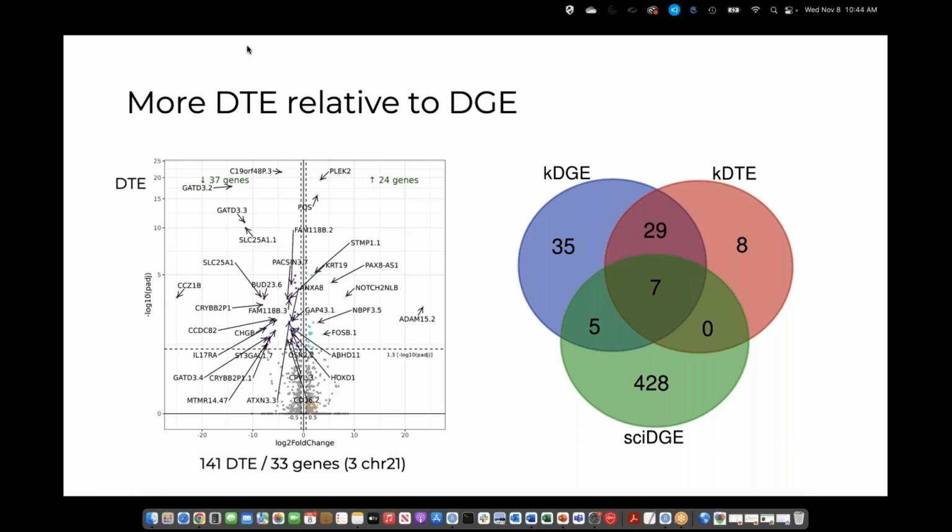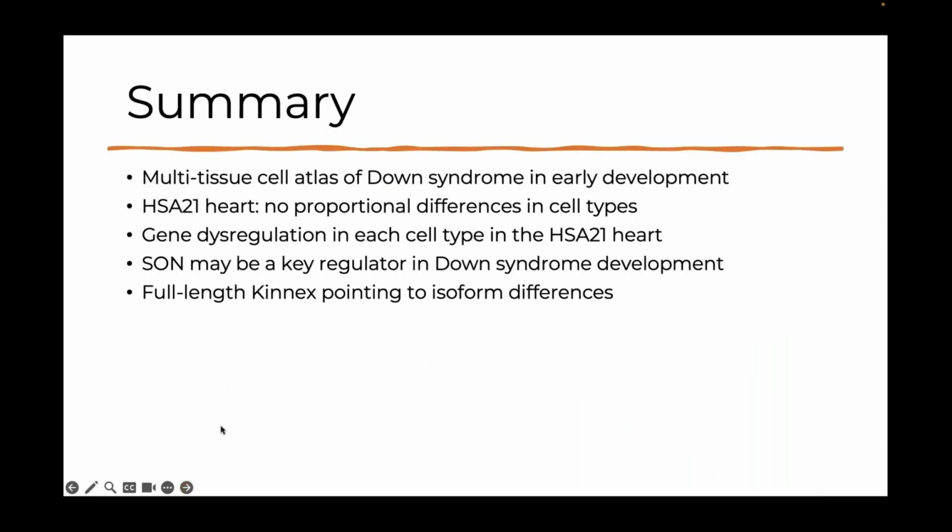And then just looking at the combination of genes that resulted from either the long-read differential gene expression, the transcript expression, or our single-cell analysis, there are certainly some overlaps as well as some distinctions. And so these allow us to look at more depth and detail into the biology, both with future and more thorough analysis in characterizing these genes, as well as pursuing additional assays.